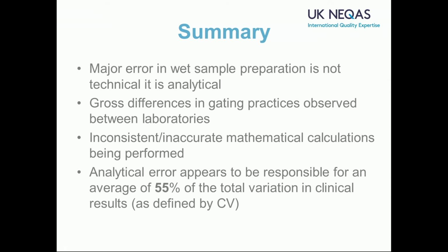But there's value in the electronic trials, in that they show us pure analytical error, and there's also value in the wet trials, because that's the combination with the technical error as well. So we're always going to be running both, but we are going to be running more of these electronic trials because they really are very informative.